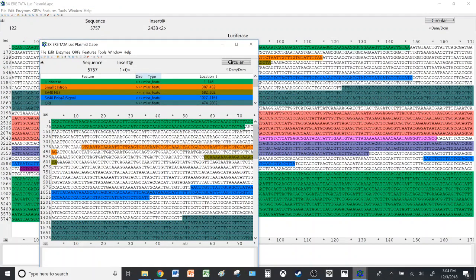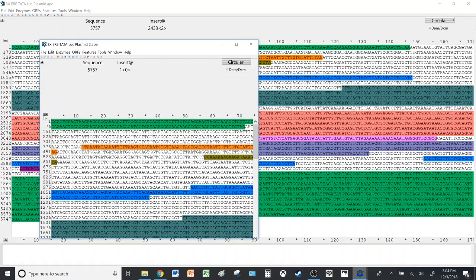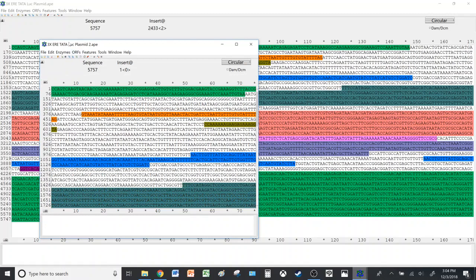So what you can do is you open both sequences that you wish to align for comparison. For this window, as you can see here, I use the same plasmid. I just saved it under a different name just to show you how this tool works.